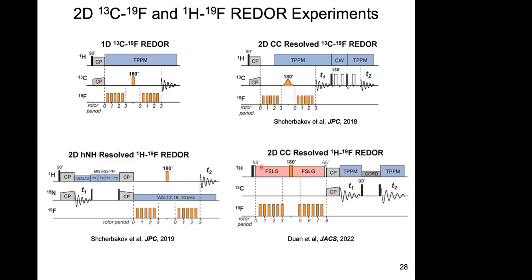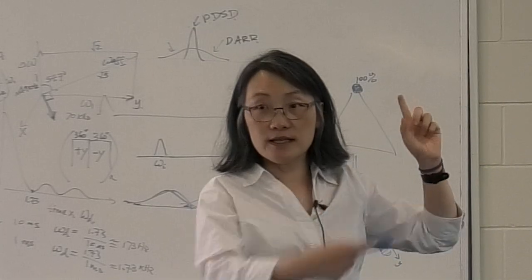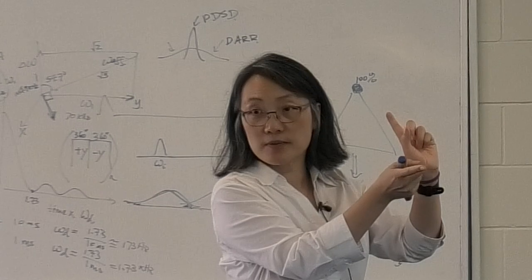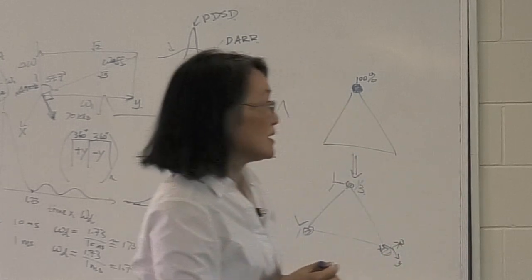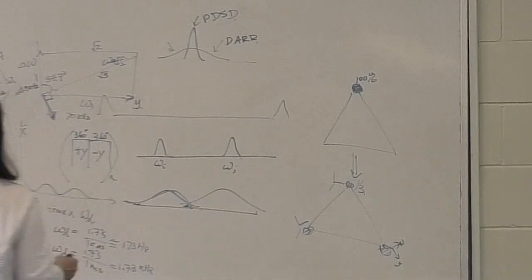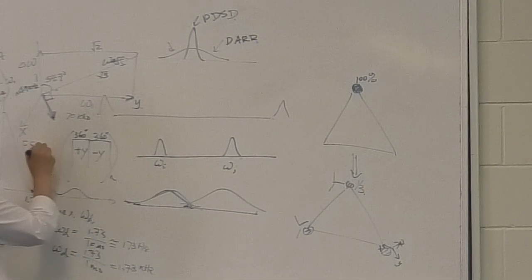Imagine you want to do proton-carbon correlation in a somewhat old-fashioned way, where you don't want to have the proton-proton coupling around. Then you really need to make sure the magnetization is in the right place, perpendicular to the tilted field. That's the purpose of the 55-degree pulse. So that's the FSLG train.